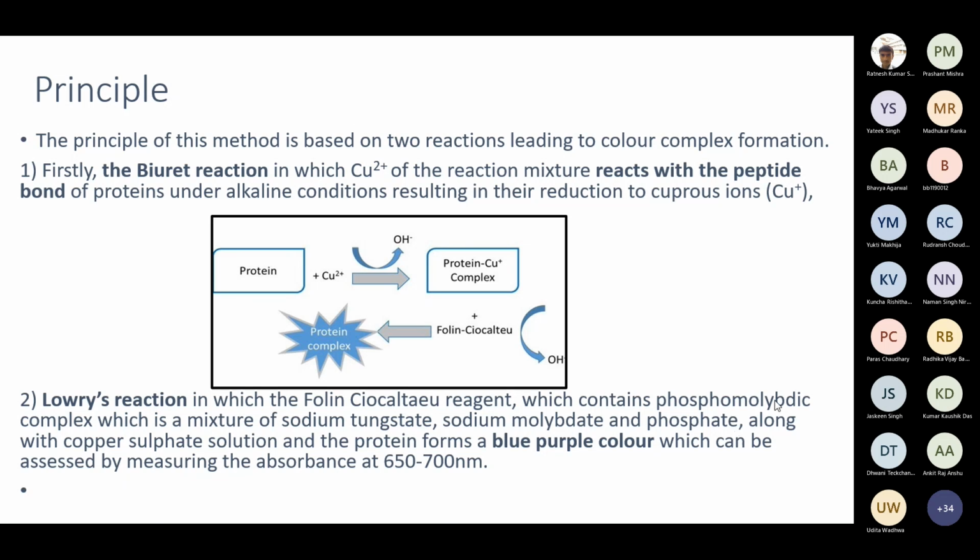The application part of this experiment, this UV visible spectrophotometer, is the colorimetric estimation of proteins. So the reagent we are going to use is the Folin-Lowry reagent.